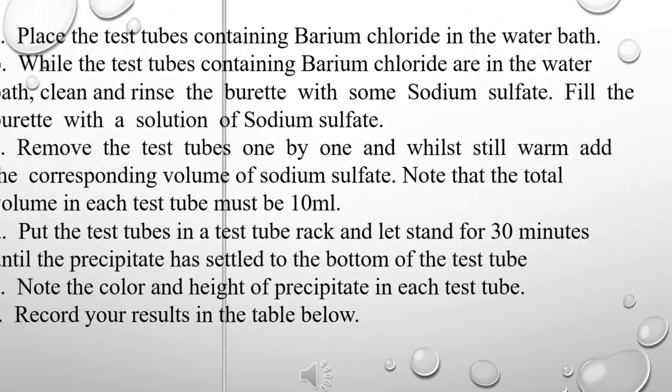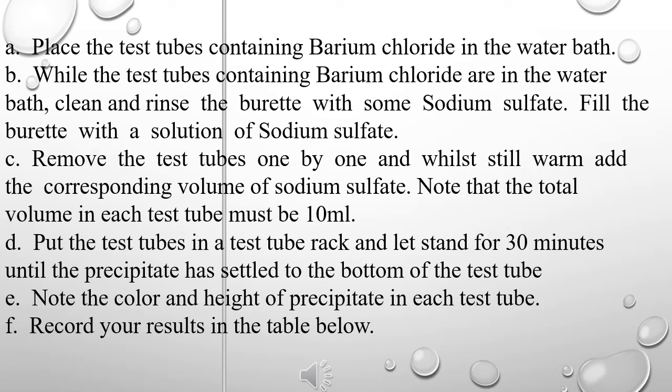Procedure 2 A: Place the test tubes containing Barium Chloride in the water bath. Clean and rinse the burette with some Sodium Sulfate, then fill the burette with a solution of Sodium Sulfate. C: Remove the test tubes one by one and, whilst still warm, add the corresponding volume of Sodium Sulfate. Note that the total volume in each test tube must be 10 milliliters. D: Put the test tubes in a test tube rack and let stand for 30 minutes, until the precipitate has settled to the bottom of the test tube.